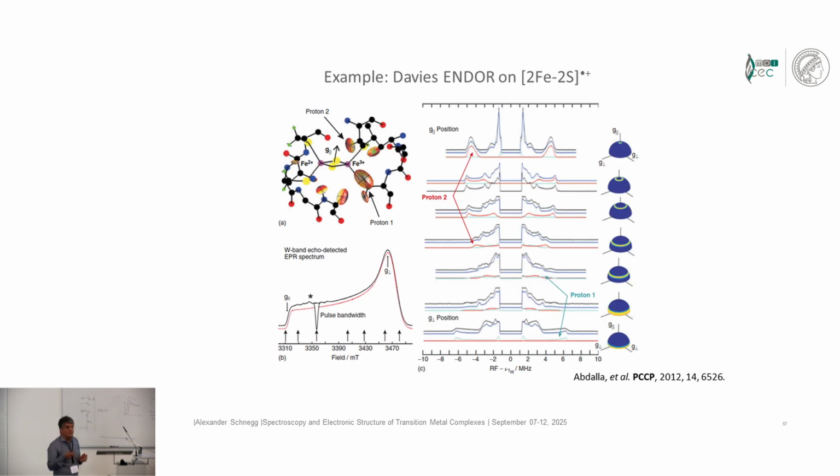And there was somebody who asked me, are you sure that the hyperfine tensor and the g tensor are always collinear? And of course they are not.